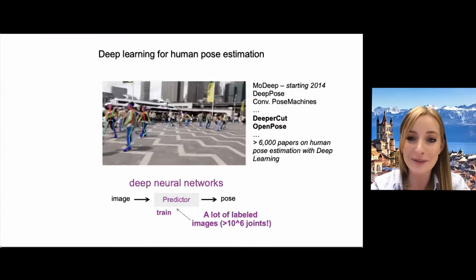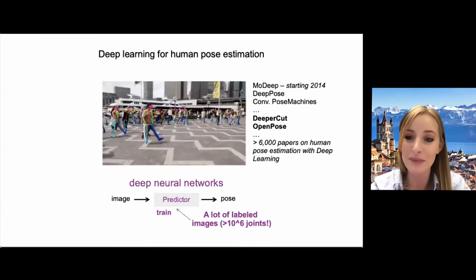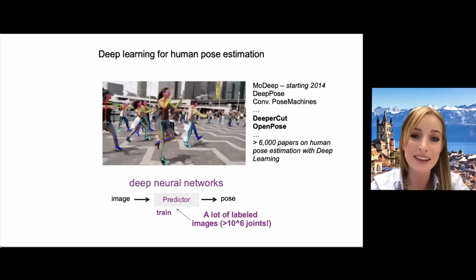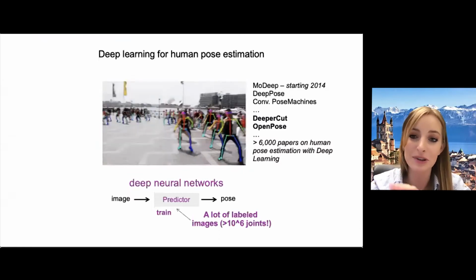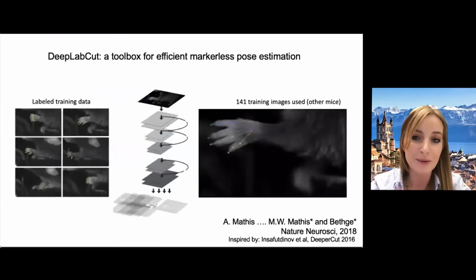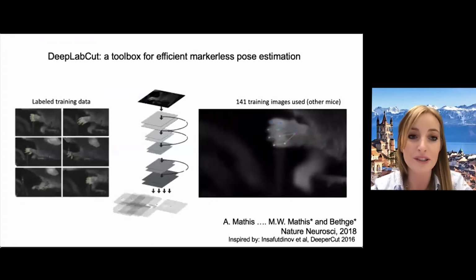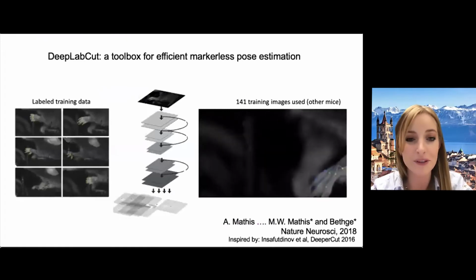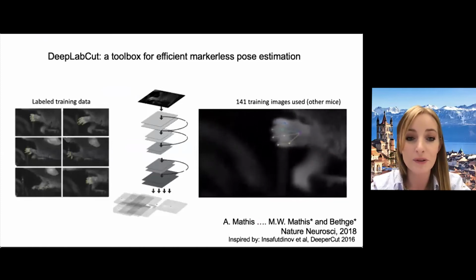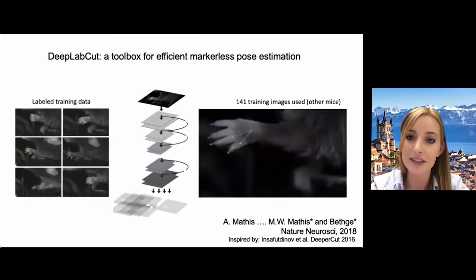And I really wasn't willing to label tens of thousands of little mouse frames in my laboratory. And so we turned to some other tools by leveraging what's called transfer learning to take pre-trained neural networks and use this in new tasks. I'm going to skip over a lot of the science here, but what resulted was effectively DeepLabCut. So what we showed is particularly for this pose estimation problem, that transfer learning is highly effective.